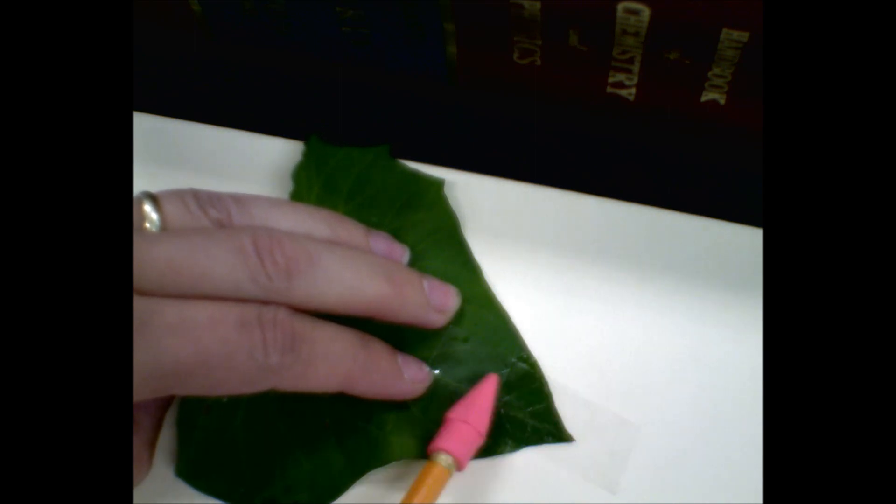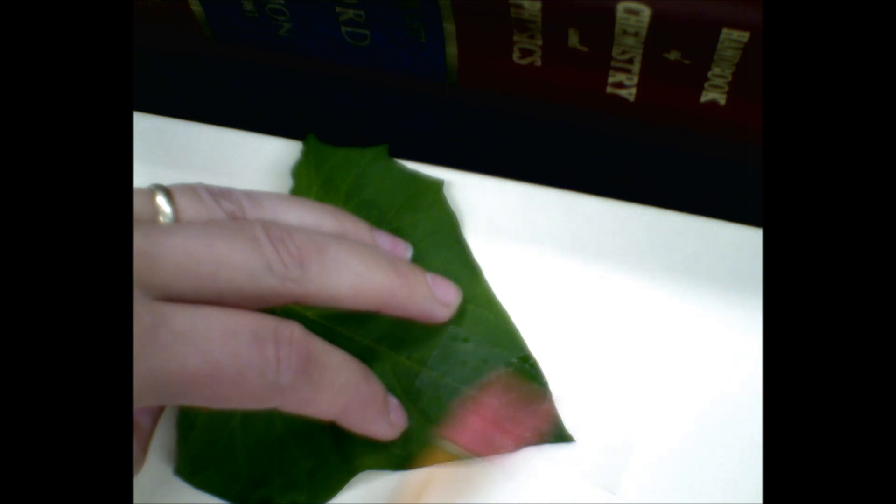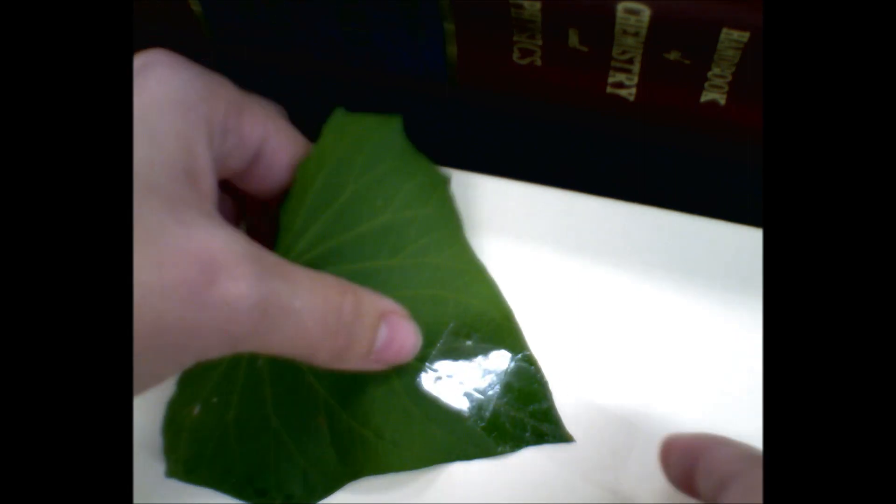You want to make sure you get good contact between the tape and the leaf that you've painted over with clear fingernail polish, because our goal is to lift the clear fingernail polish off of the leaf.